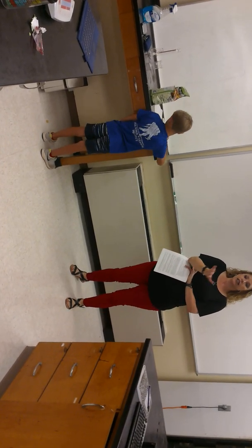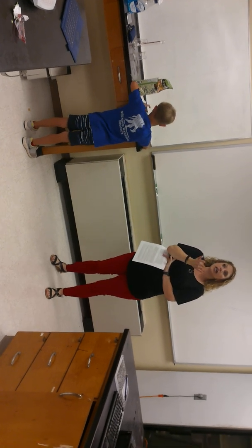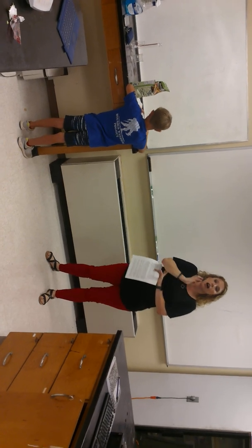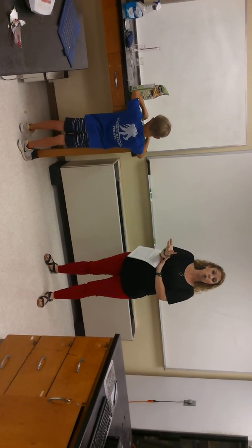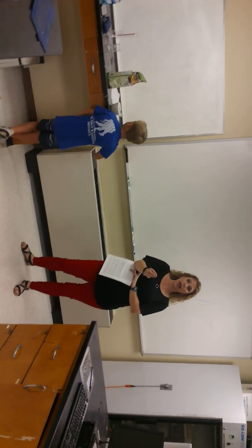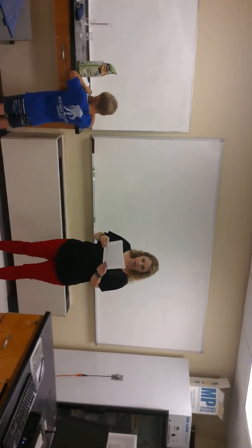Another thing that could affect it, you've got this glass. Once you put it under the heat lamp, you've got to let it get to room temp. Things like heat affect weight, okay? So if it is not room temperature, you're going to get an incorrect weight. So be sure that that watch glass and everything is very, very much gotten back to room temperature before you weigh it. So again, those are a couple of things if you get over 100% yield: go back, reweigh. Maybe you didn't let it get all the way to room temperature. If that doesn't work, put it back under the heat lamp. It usually means that it didn't dry well enough, okay?